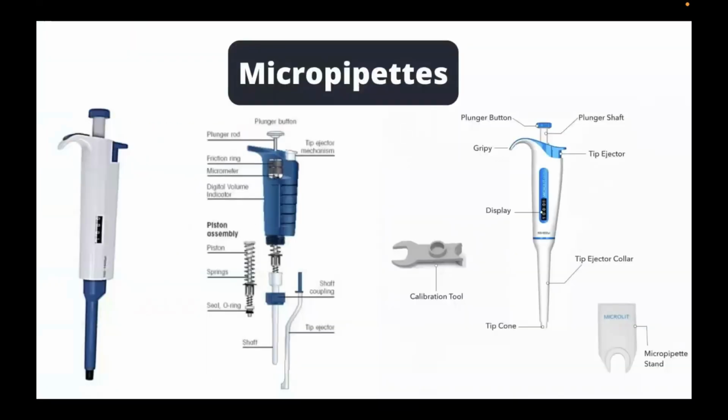So in our lecture part for your period 3, we were able to discuss the different equipment, materials, and consumables that are being utilized inside a molecular biology laboratory and COVID-19 testing laboratory. So one of which is yung ating micropipettes. So pipettes, madami talaga yung types and categories na ginagamit sa different sections of the laboratory.